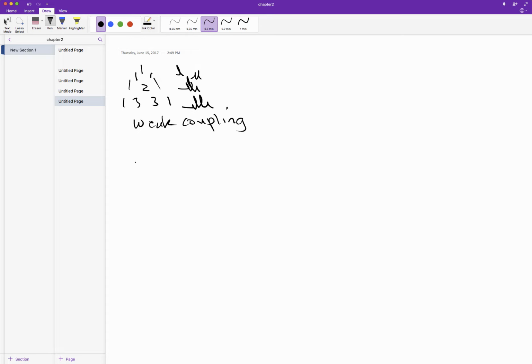What that means is that this peak, say HA, is a long way away in terms of chemical shift from HB. Basically, the frequency of A minus the frequency of B is much, much greater than the coupling constant of AB.